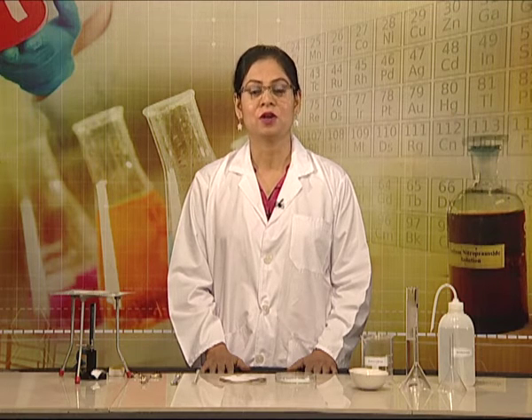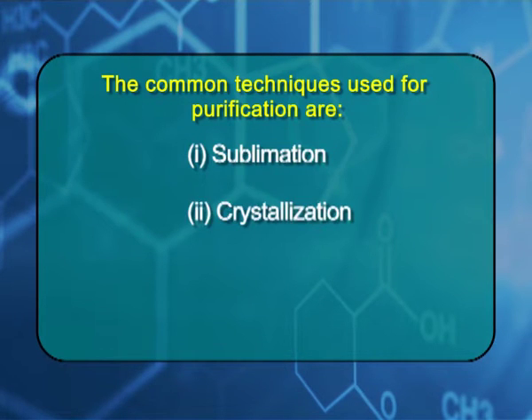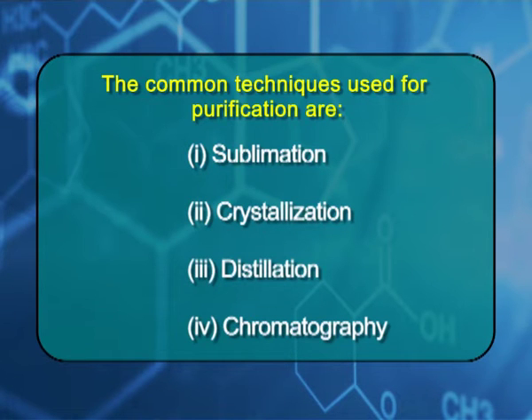Various methods are used for the purification of an organic compound, based on the nature of the compound and the impurities present in it. The common techniques used for purification are sublimation, crystallization, distillation, and chromatography.